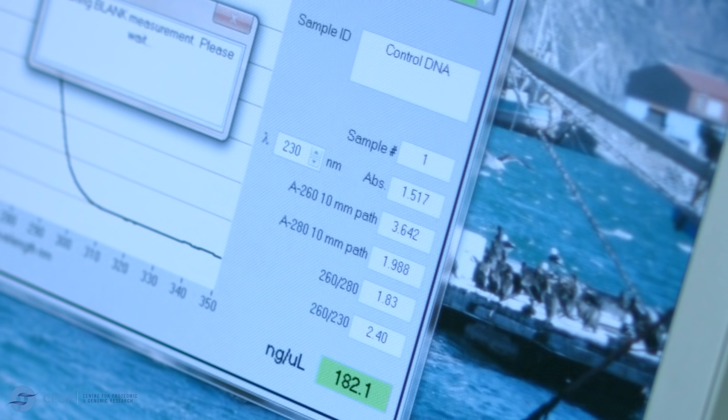The gel is set to run at 100 volts for 20 to 30 minutes. At the end of the run time, the gel is removed from the gel tank and transferred to a gel dock system or transilluminator to visualize the DNA.